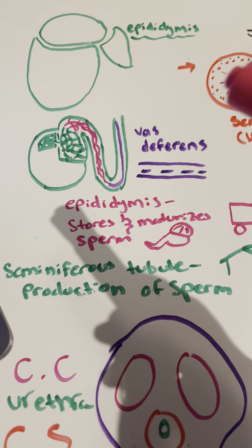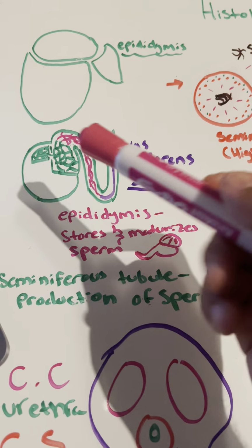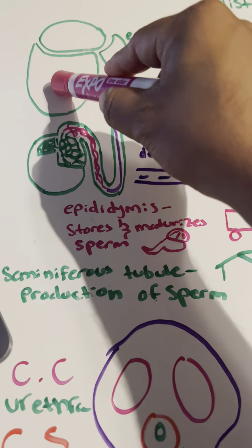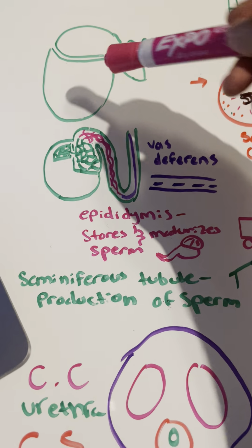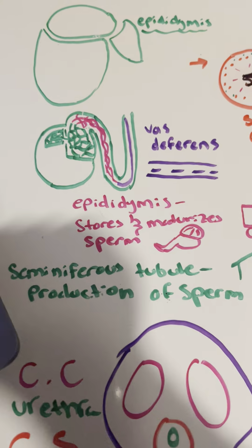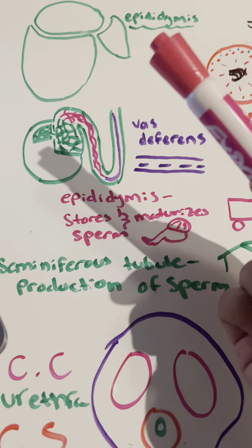And the epididymis, as well as the structure and histology of the actual sperm, you'll notice has these same structures here. So right here in this main structure, we're going to have the seminiferous tubules, which is the cross section that we're looking at right now, and up here is going to be the epididymis, and then this other portion that goes downwards, which, like I said, is similar here, is going to be the vas deferens.